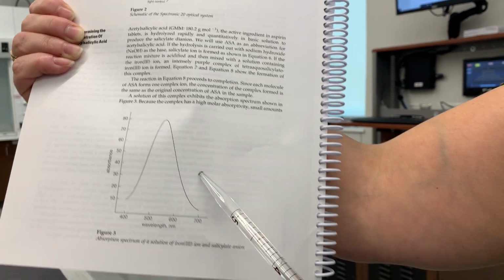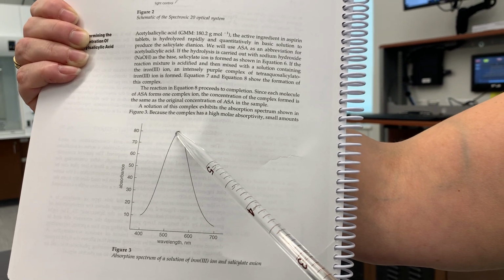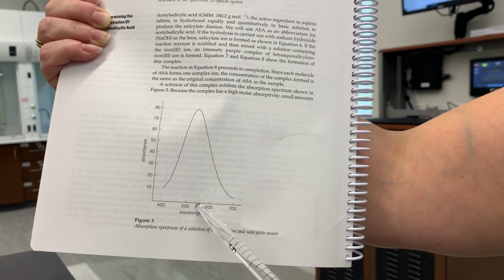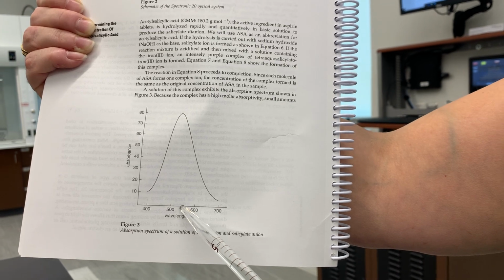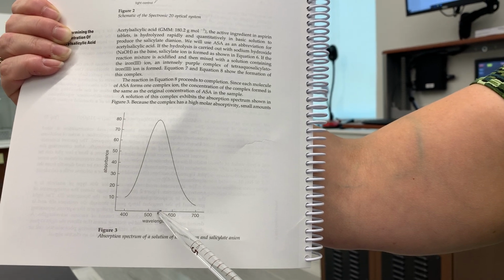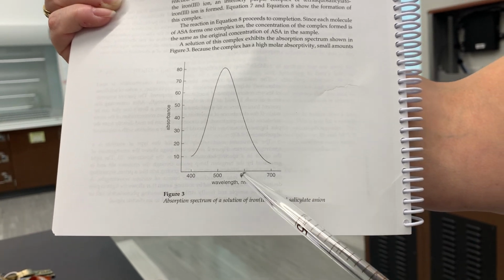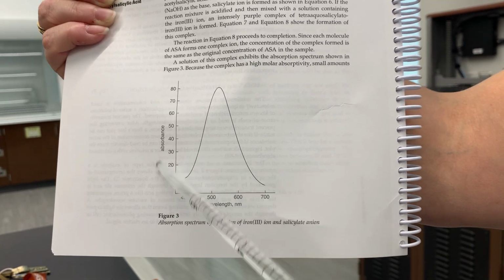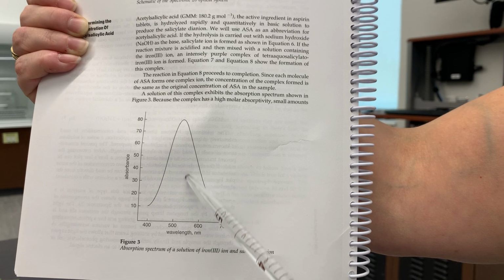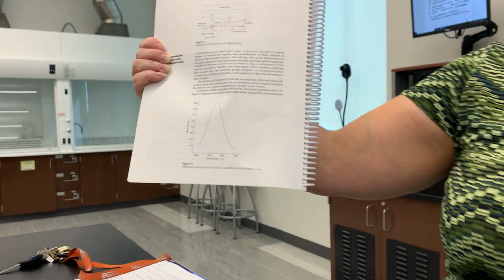So looking at this curve, how would you find analytical wavelength? Well, you would look at the portion of the curve where absorbance is the highest, right here, and you would then go down to the x-axis, and it shows right around 530, maybe 540 nanometers. And that's how you would know how to find analytical wavelength. So in the quiz, if I gave you a graph similar to this, and I asked you to find analytical wavelength, and you have absorbance up here on the y-axis, you would simply find the portion of the curve where absorbance happens to be the highest, and carefully go down to the x-axis and find the wavelength at which this maximum of absorbance occurs.